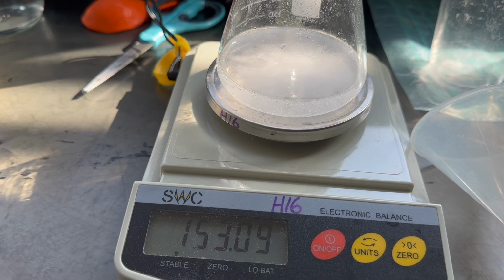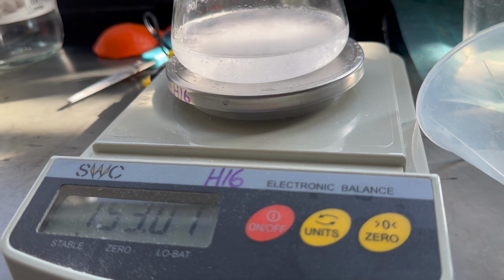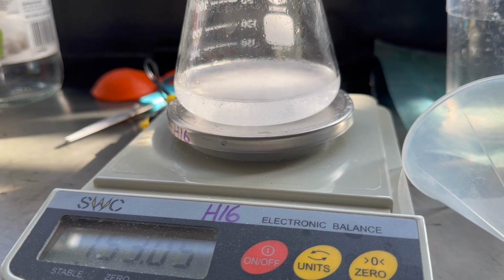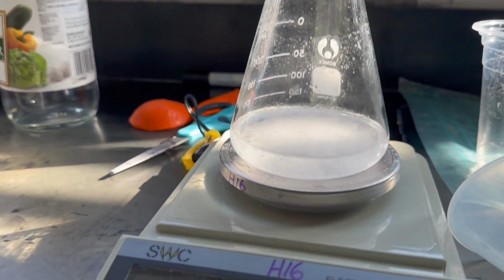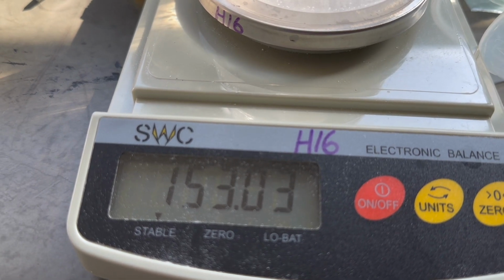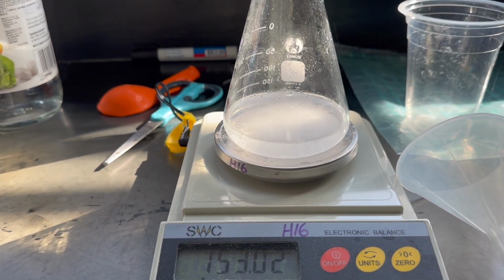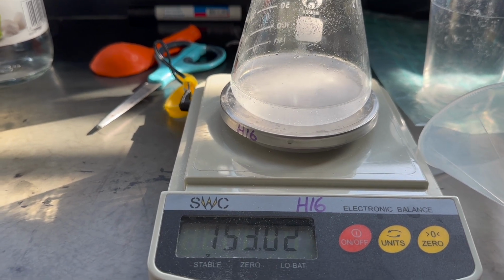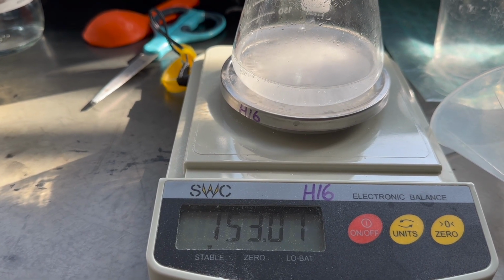153.09 grams. Is it done? You can see gas bubbles are being produced, and as those gas bubbles rise through the liquid, the gas is released into the atmosphere where it escapes. I don't know if you know this or not, but gas does have mass, and as this reaction is running, as gas is being produced and released into the atmosphere, it is decreasing the overall mass of the products that we started out with.